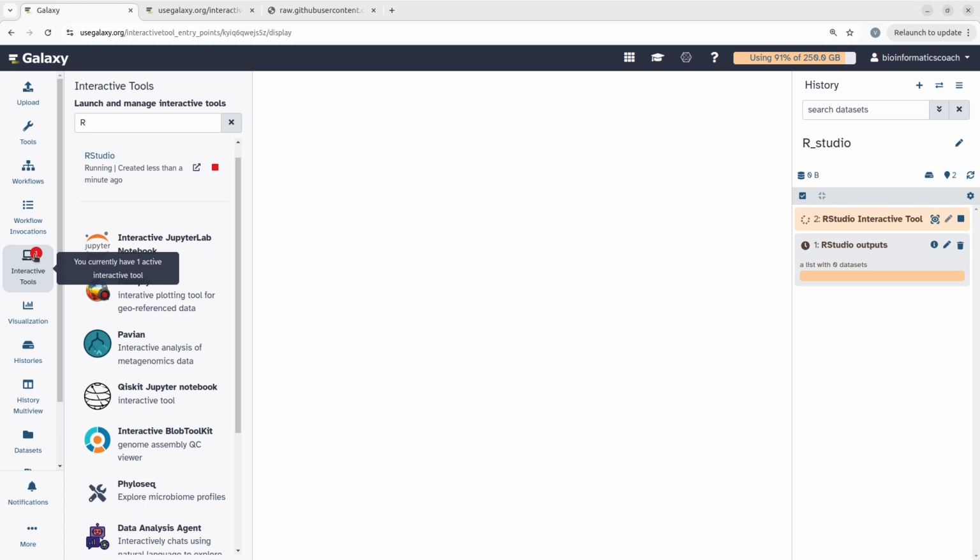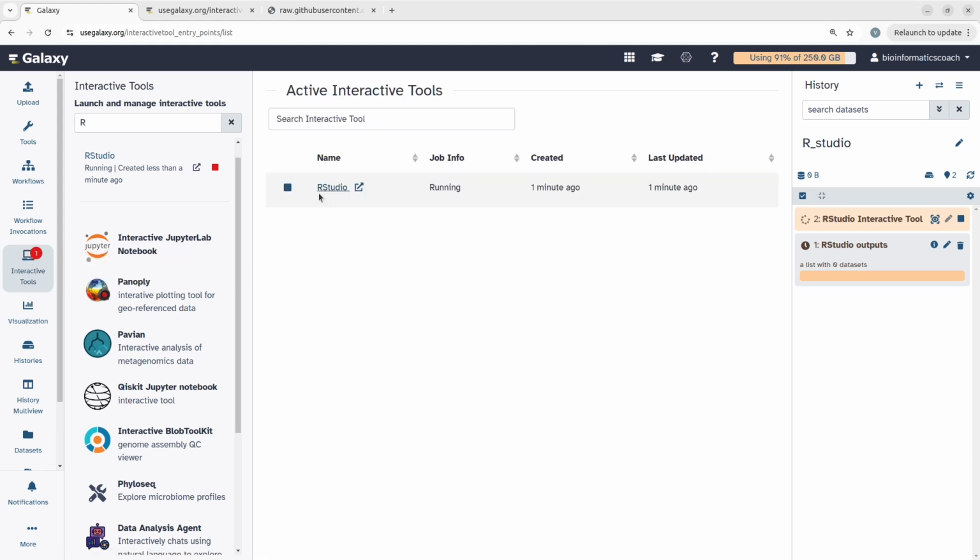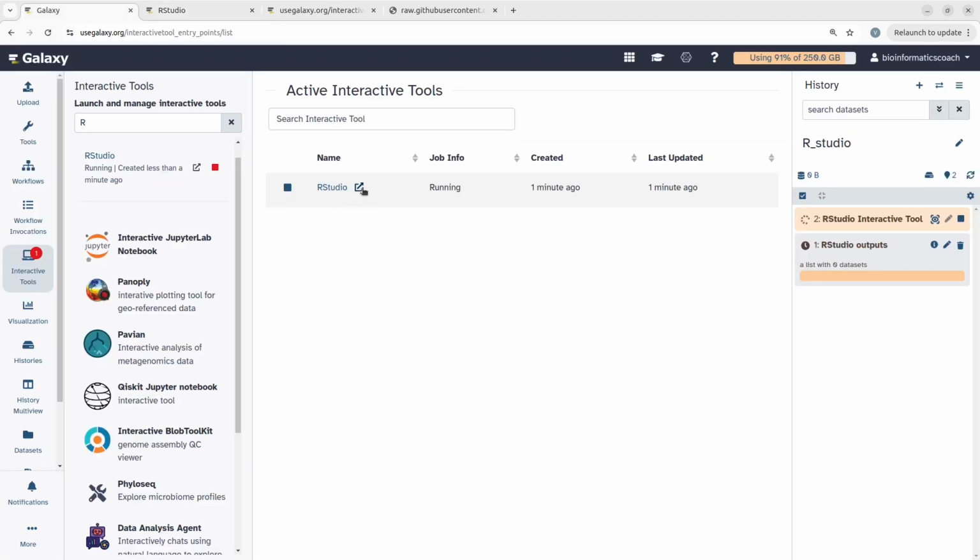All right, this one still does not work, so I'll just come back and then I'll use this one, open new tab. That should be fine for me. All right, so I'll open a new tab. I come here, open a new tab. So that's what you need to do.